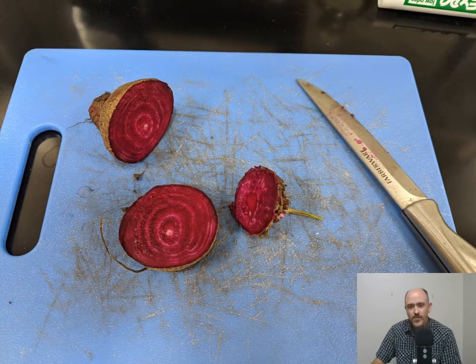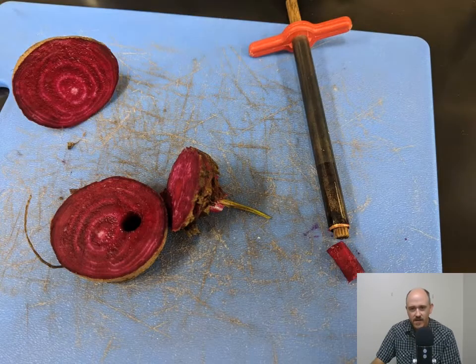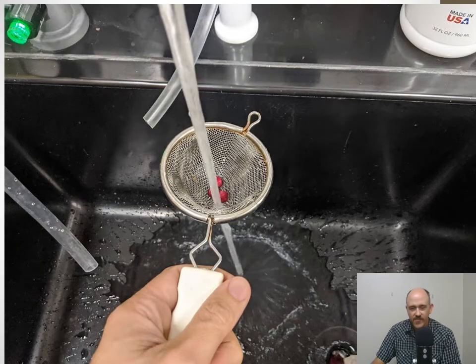So the way we would do this is we would cut up a beet. We would take what we call a cork borer, which is just a hollow tube, and we would stab it into the beet, and we would get a cylinder like this, which we would then cut up into discs that are 5 millimeters wide. Then we would rinse those discs off in the sink because we don't want to measure beta-cyanin leakage from a knife cut on a beet.